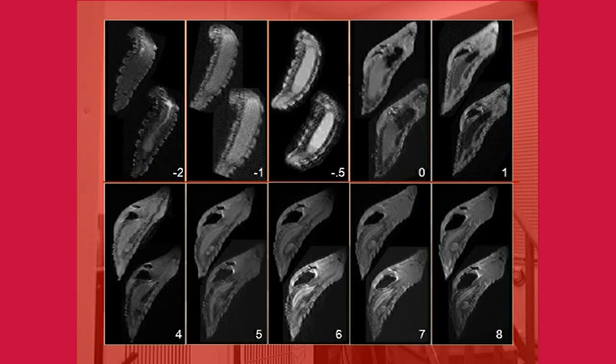First, it can be seen that the internal structure also changes dramatically during molting from the prepupa to the pupa. In particular, the alimentary tract, which occupied most of the interior during the larval period, becomes smaller rapidly. Then, as the days go by, there appear to be cavities under the antennae and under the mouth, which grow larger and larger. It feels strange that this part becomes hollow.